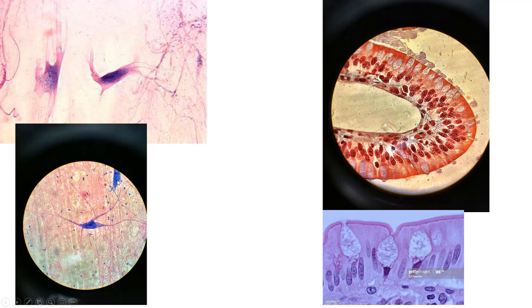And finishing up, we have nervous tissue. You see a couple of neurons here, and then another one here and here. We call this a neuron smear because it just looks like a smear of neurons on the microscope slide. So just know this right now, this is nervous tissue. This is a neuron.